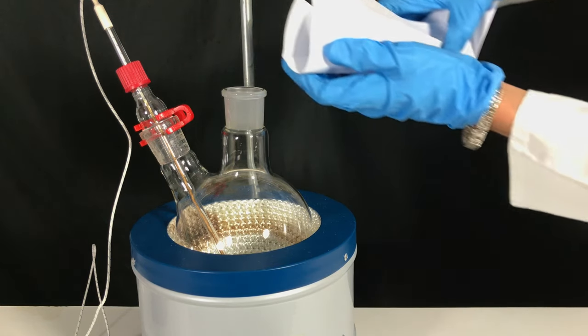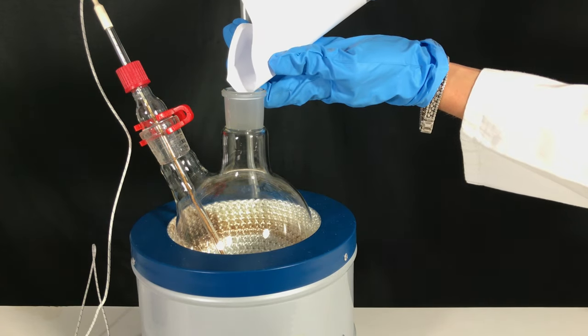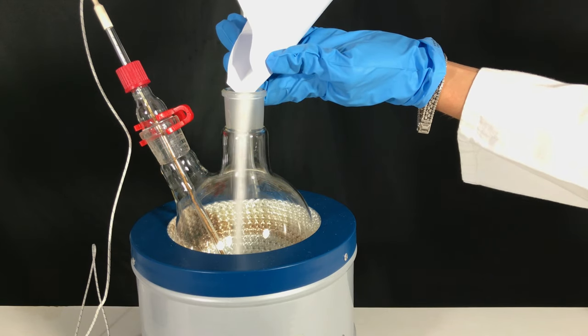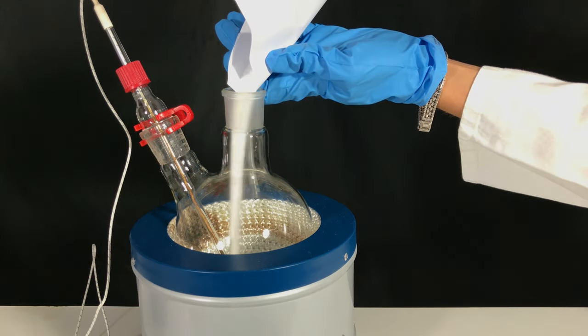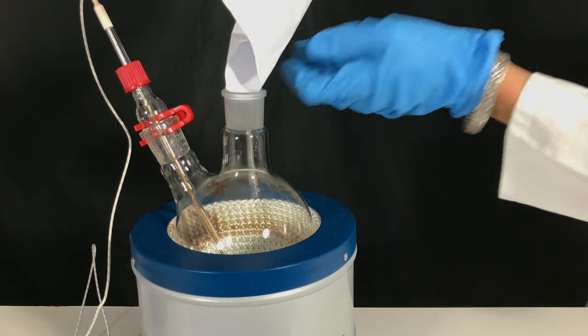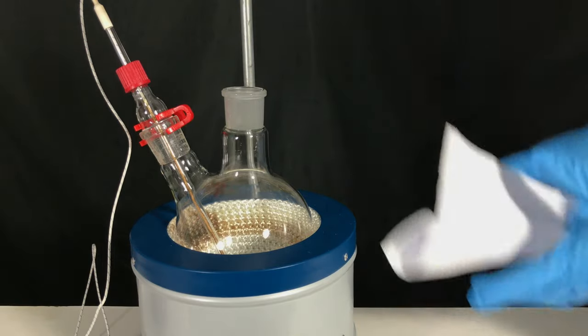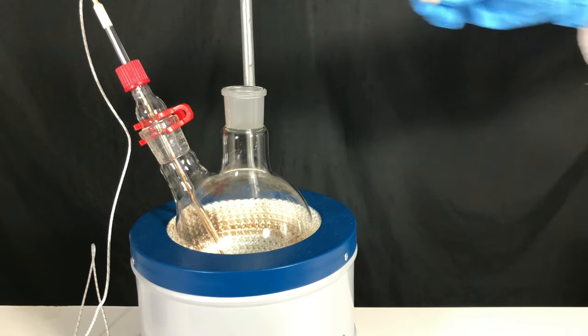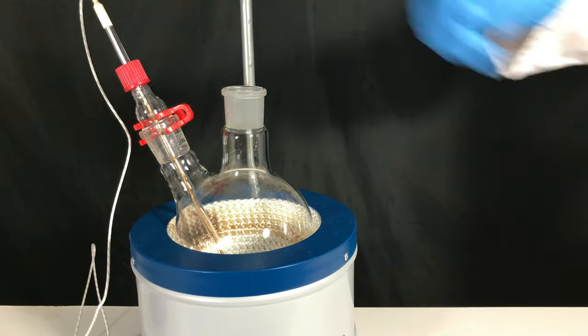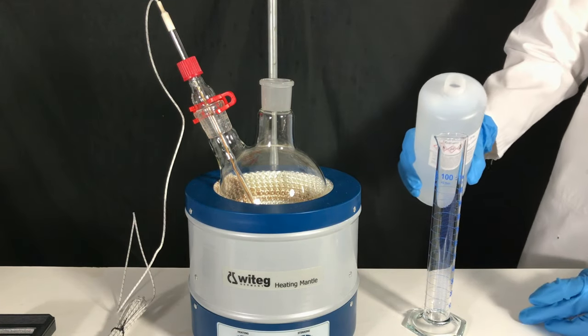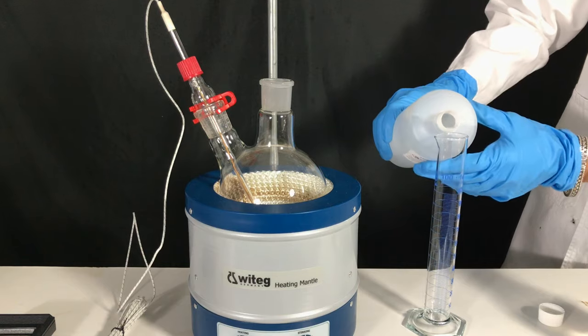We start off by adding all of the boric acid to a 1 liter round bottom flask. A magnetic stir bar is dropped in. Afterwards, 200 ml of methanol are measured out and added.